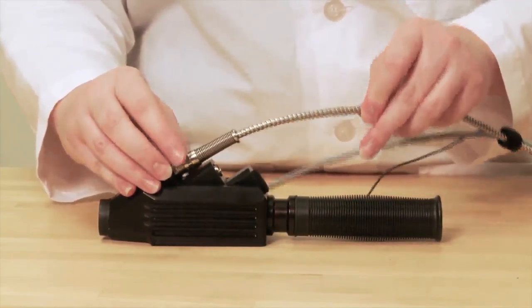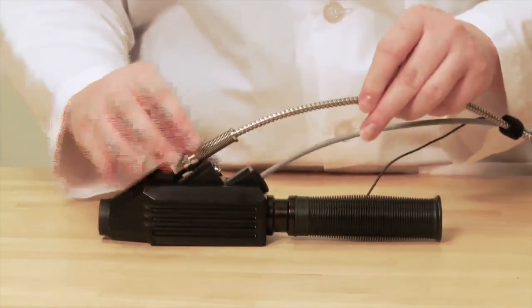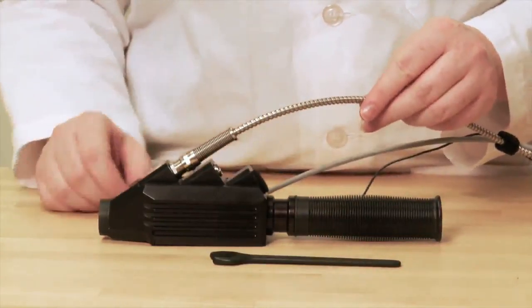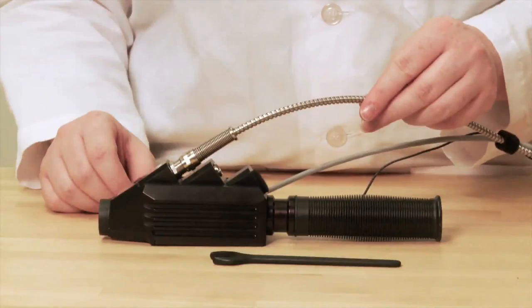If the fiber optic cable feels loose after hand tightening the metal strain relief sleeve, use the wrench provided to firmly tighten the metal strain relief. If you have a PVC cable, be cautious to not over tighten.